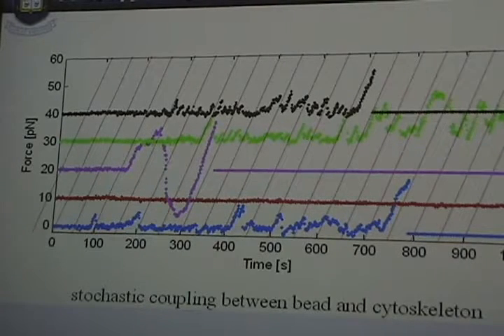Right now, today, we're analyzing these traces and doing biological manipulations to understand the mechanics of how the cell generates these tens of piconewtons of force, and to understand the mechanism. Ultimately, we want to understand how the cell can figure out where to go inside your brain. Okay? So that's one example of how to use optical traps in an experiment.